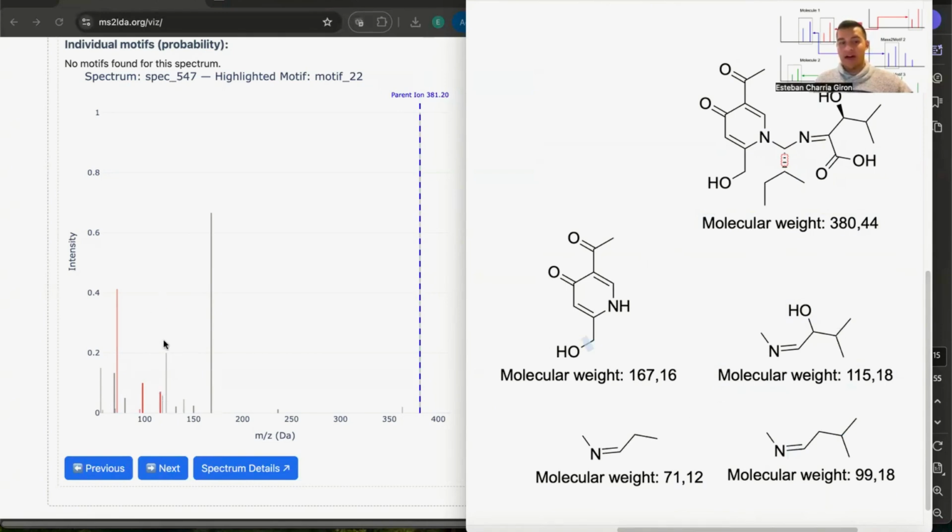So we see 116, so it means that the neutral mass of that fragment should be 115 Daltons, which means that a nitrogen remains on it, and something like this could be hypothetically possible. However, we will need to look at it really carefully, and if possible, even incorporate a pseudo formula of those fragments to be really sure that it is the actual hit.